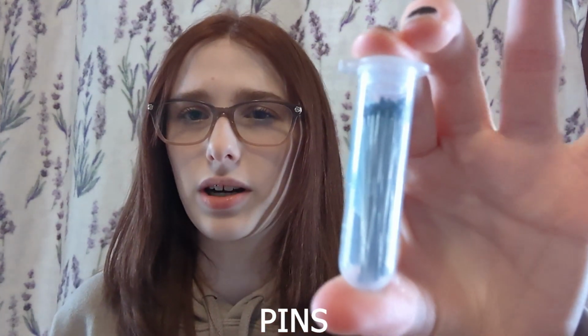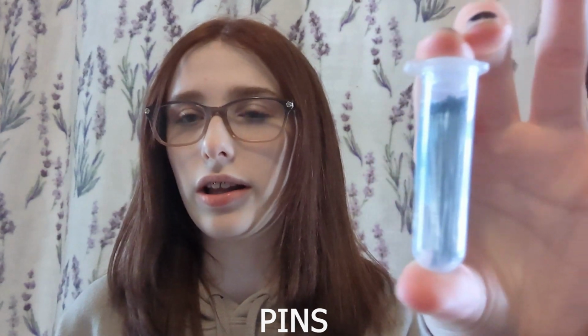Then of course you're gonna need pins. Just any type of pins work. These are very small and thin, but it doesn't matter. You can honestly use thumbtacks because the pins do not puncture the wings. You will need one pin to go through the body, one or two depending on what you prefer and how big your specimen is. But other than that, they don't puncture the butterfly at all.